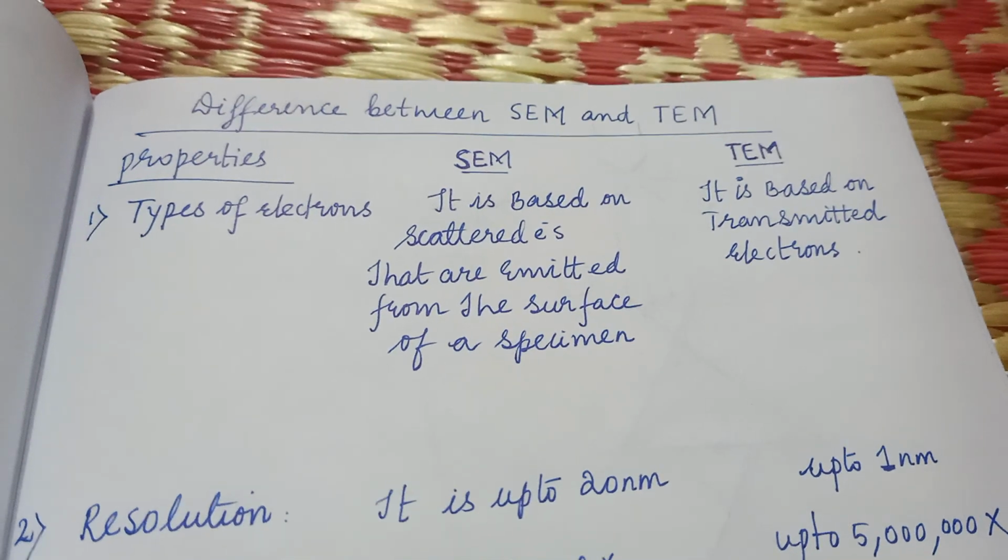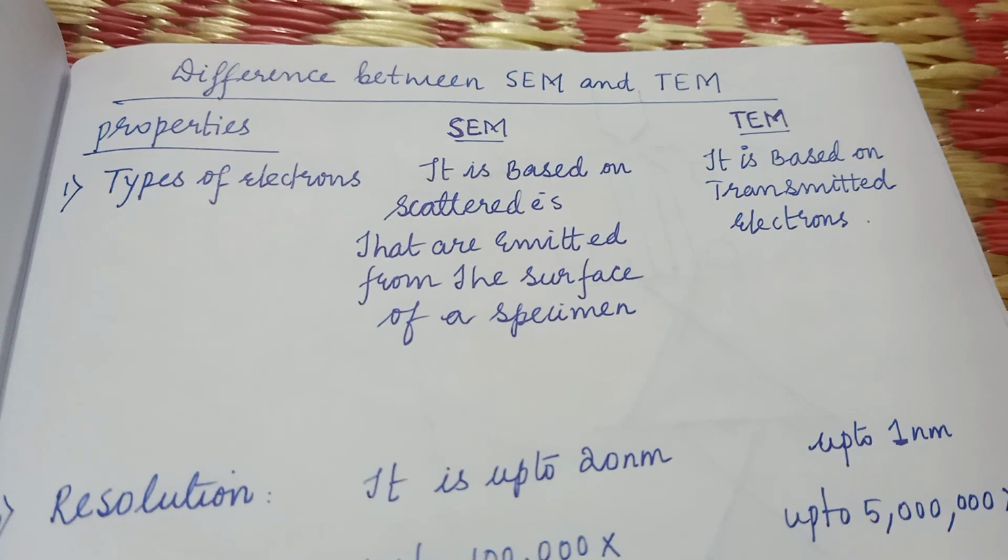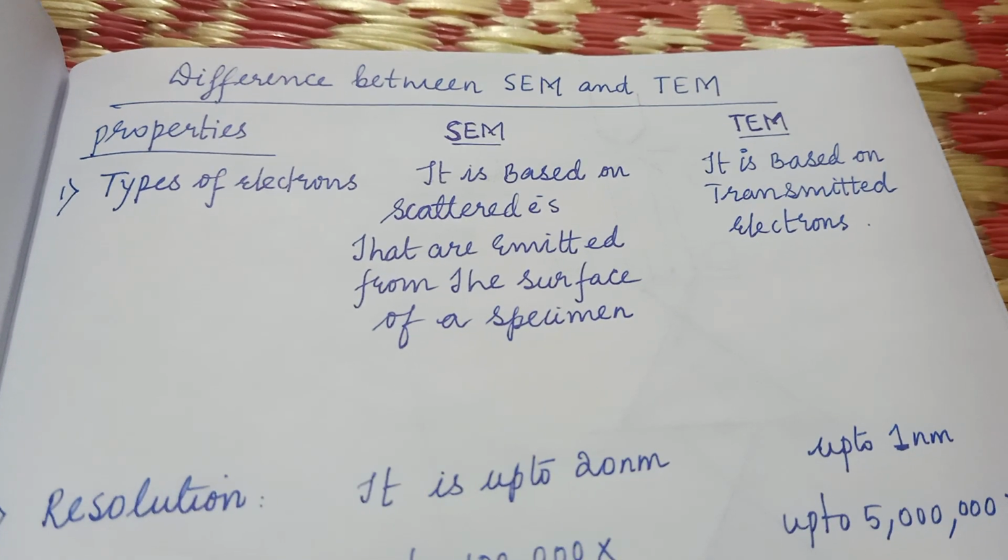Hi everyone. This video is regarding the difference between scanning electron microscope and transmission electron microscope.